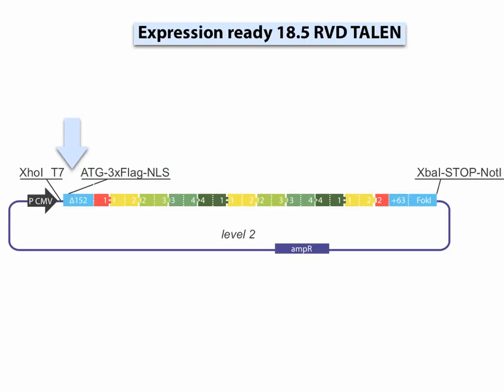The final product of the LIC TALE assembly protocol when using the 2-mer fragment source library is shown here. It is an 18.5 RVD TALEN based on the AvrBs3-like backbone of Miller and colleagues. It starts with an N-terminal triple FLAG tag, a truncated AvrBs3-like N-terminus containing a thymidine-specific cryptic recognition unit, which is followed by the central tandem repeat units that form the core of the DNA binding domain, and finally a C-terminal half-repeat unit and a C-terminal FokI domain fused at a functionally optimized C-terminal truncation point.